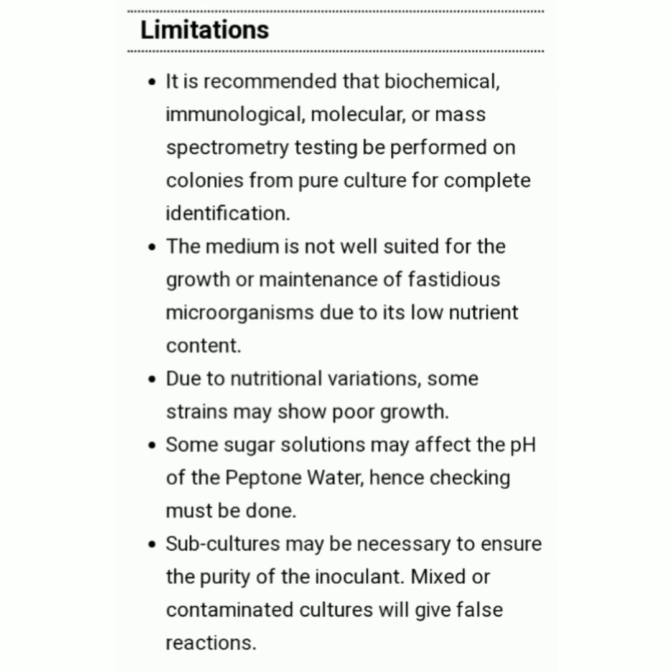Another point is that the medium is not well suited for the growth and maintenance of fastidious organisms, because of the low nutrient content present in this medium. We can grow them, but we cannot maintain the organisms in the media, due to the poor nutrition present.